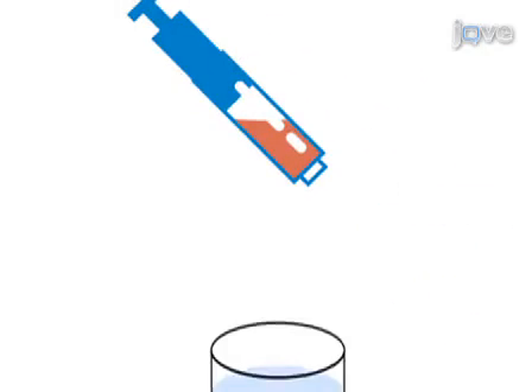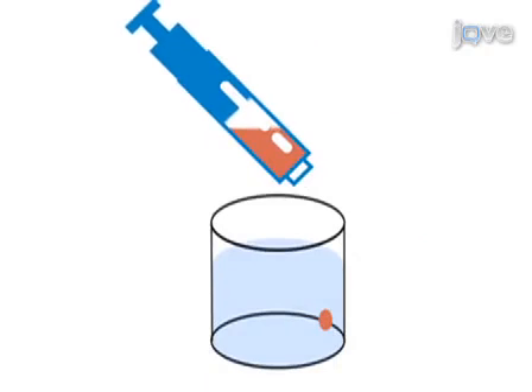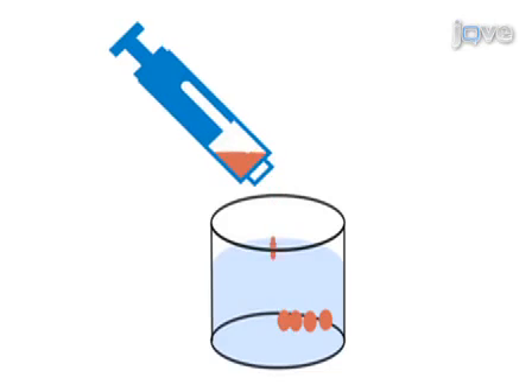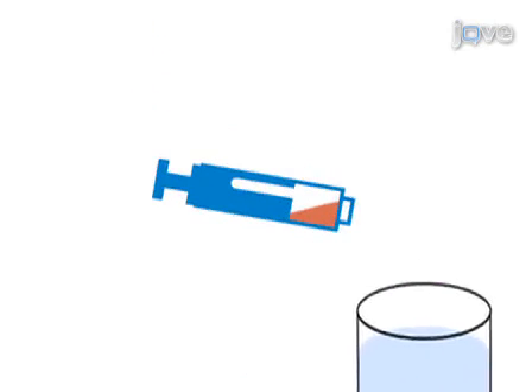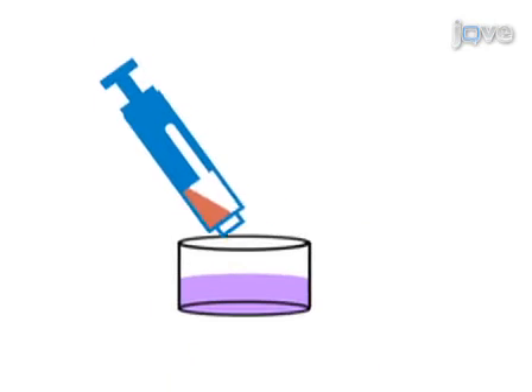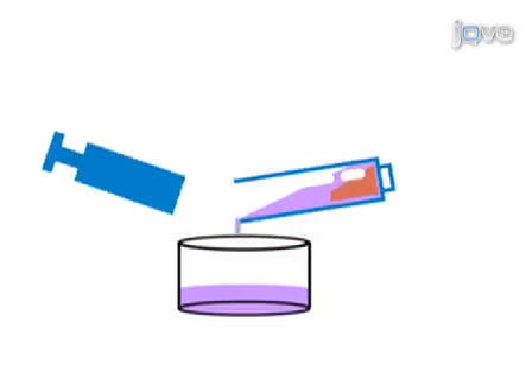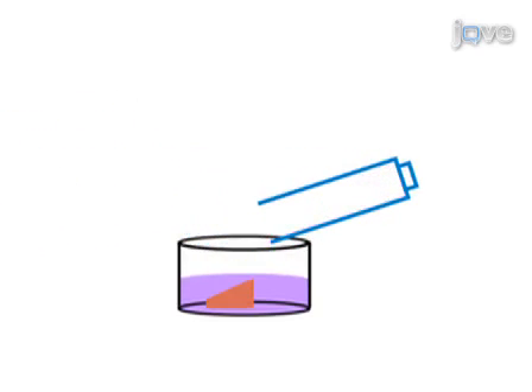Five to six fragments of the fibroadipose tissue are transferred from the biopsy syringe into glutaraldehyde solution, and the remaining material is allowed to clot in the syringe. 10% formalin is aspirated into the syringe and the plunger is removed to transfer the clotted fibroadipose tissue into 10% formalin.